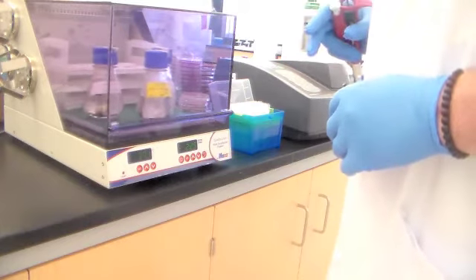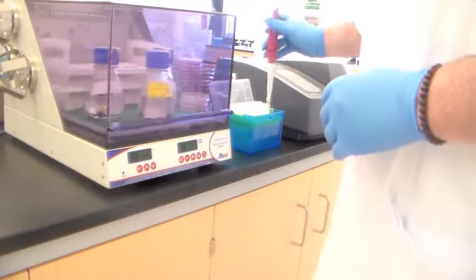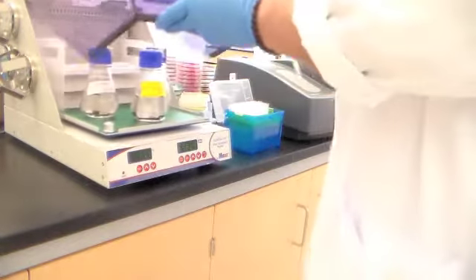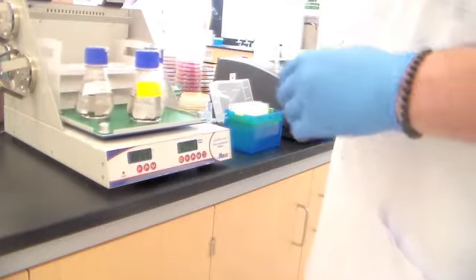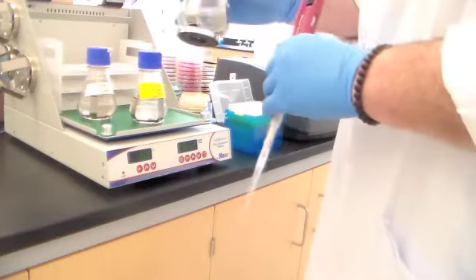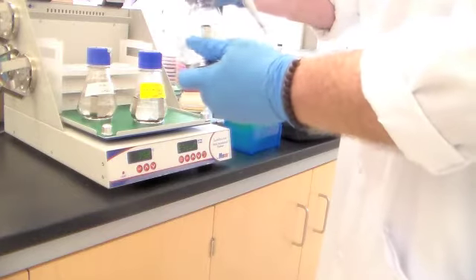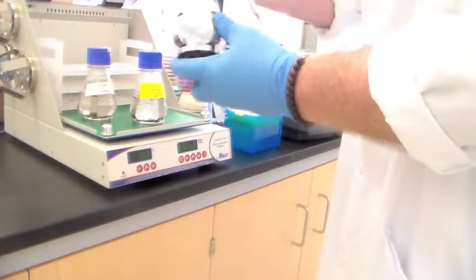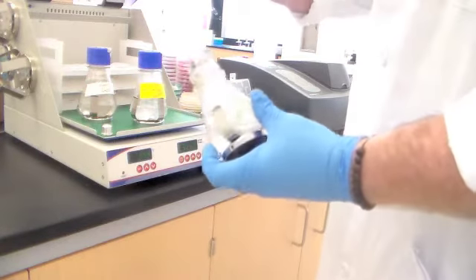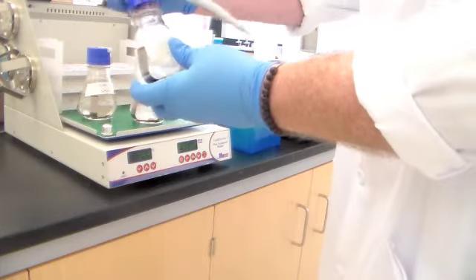When you come in, each of your lab groups is going to have a time point assigned to them. And at your assigned time point, you're going to take a sample from an E. coli culture growing in a minimal defined media. So it looks very much like water. I just inoculated this media a few minutes ago, so I'm going to take the time 0 time point. I'm taking a 500 microliter, or 1/2 of 1 mil, aliquot.